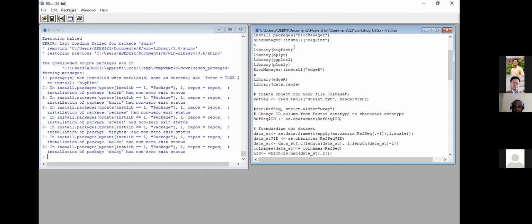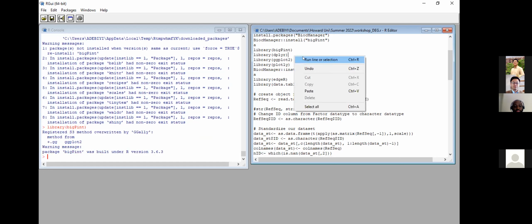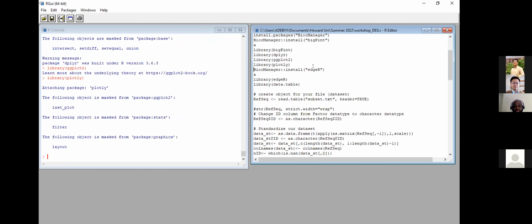So what I can do now is library the bigpint. Don't take too long. All right. Do the dplyr, ggplot2, plotly.